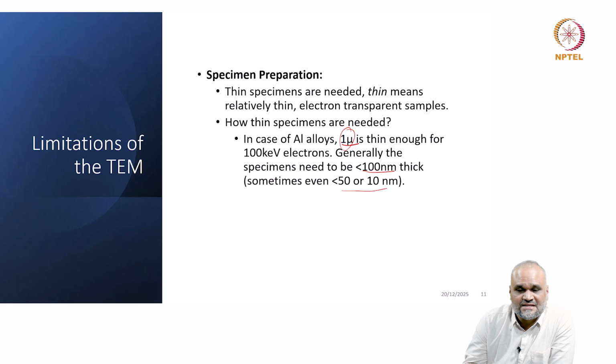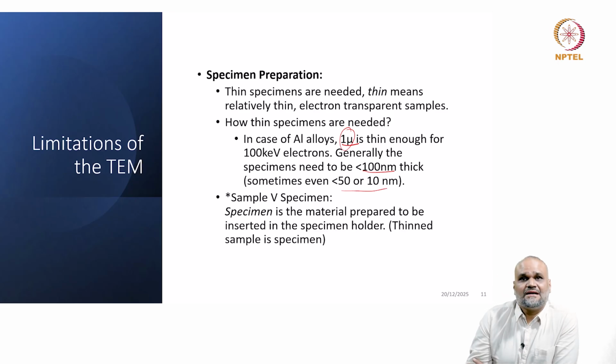When I have such thin specimens, we often come across questions on what the effect of the large surface is, and how realistic the changes that I make to a specimen are, how they correlate with a bulk sample. These are questions that you will always come across. I'm just telling you one important difference that you should remember throughout the course.